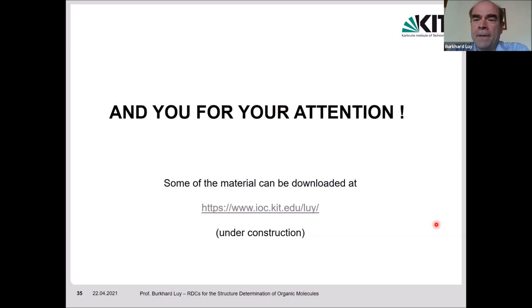Okay, now we have two questions, or actually three questions for the Shaka HSQC. There's one from Wolf Bulls. On your sequence, did you try Shaka HSQC on a 25 kilodalton protonated protein? And what are typical pulse lengths of BURBOP at a radio frequency, rotation frequency of 25 kilohertz? Okay, so these are two questions actually.